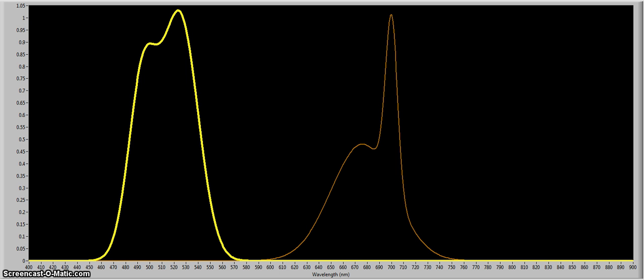The normalized absorption spectra of the 2 fluorescently labeled antigens, otherwise known as chromophores or sometimes referred to as targets, are shown in the chart. The green chromophore has a center around 500 nanometers, while the red chromophore has a center around 700 nanometers. Low-cost LEDs were selected as the illumination sources.